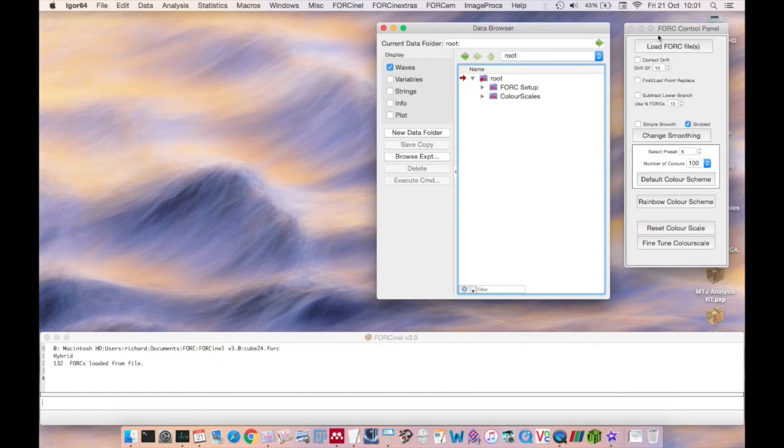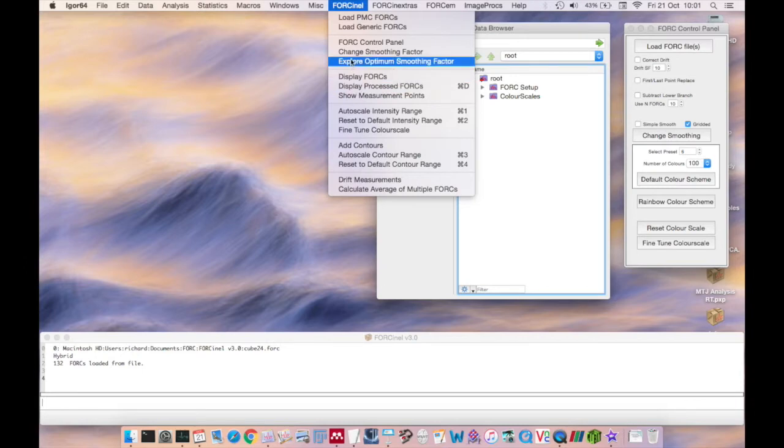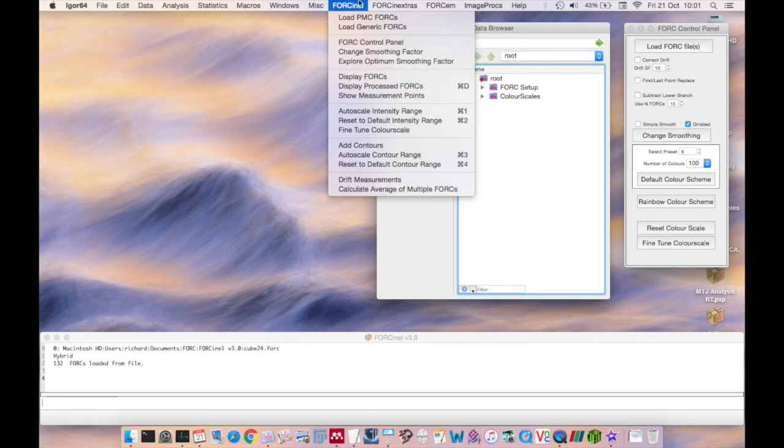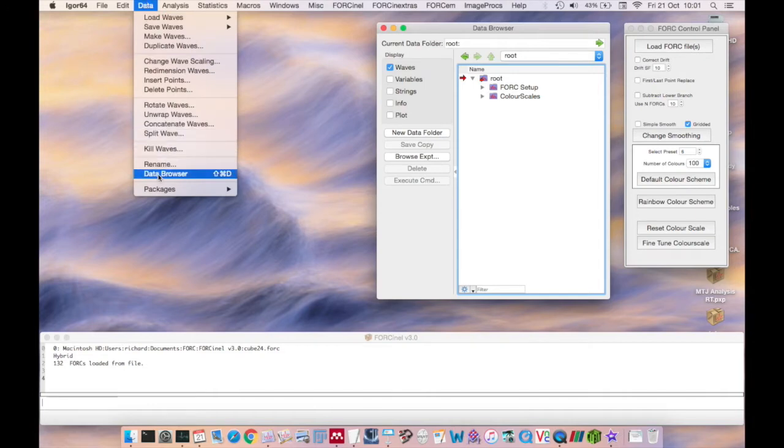Please keep both the Data Browser and the Fork Control Panel open at all times. If you accidentally close one, the Fork Control Panel can be recreated from the ForkNL menu here, and the Data Browser can be recreated from the Data menu here.